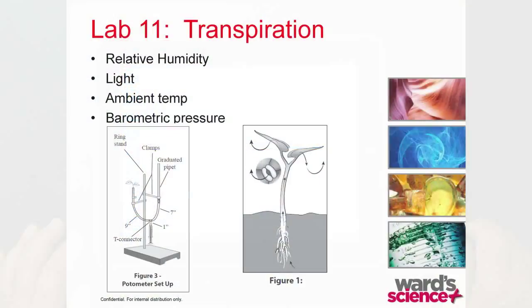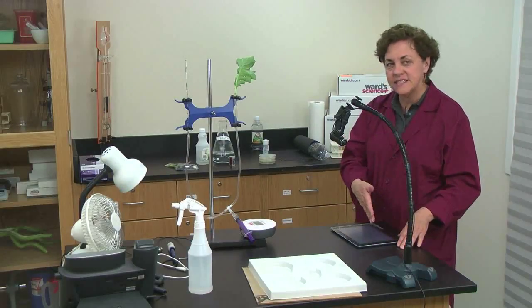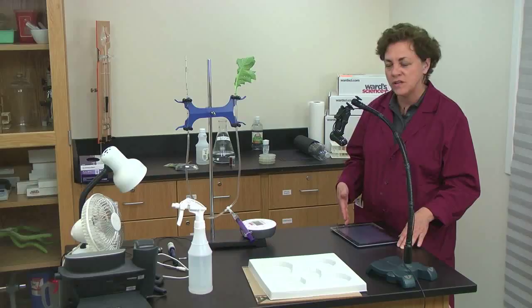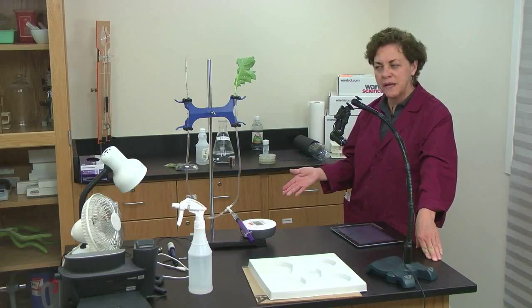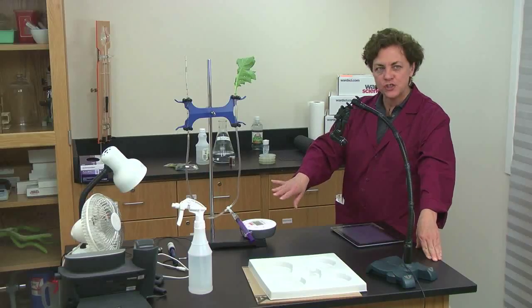Also, I wanted to point out on the PowerPoint that there are some new drawings. We tried to make the literature more understandable, so you can see, especially Figure 1 there, is one of the new illustrations that we've added. All right, so you can see that it's staying basically the same all across the screen, which you would expect since we haven't done anything to it yet.